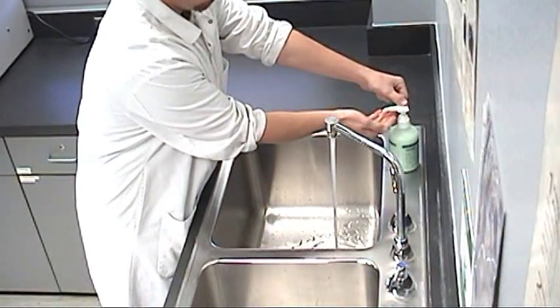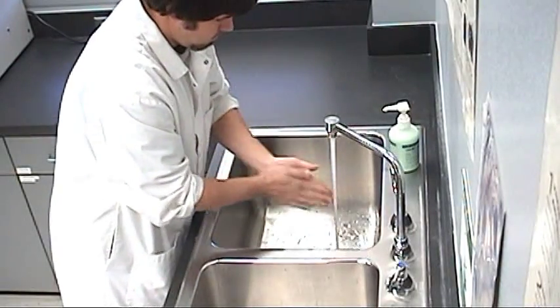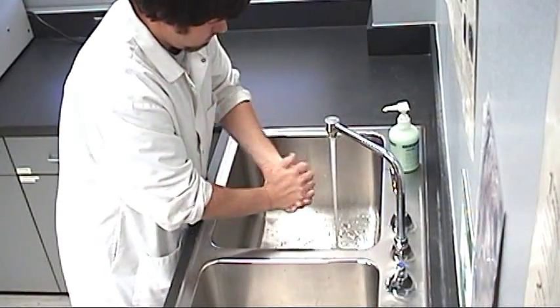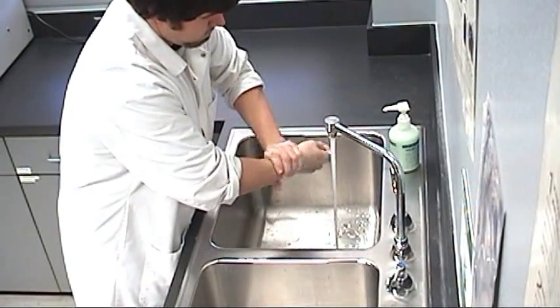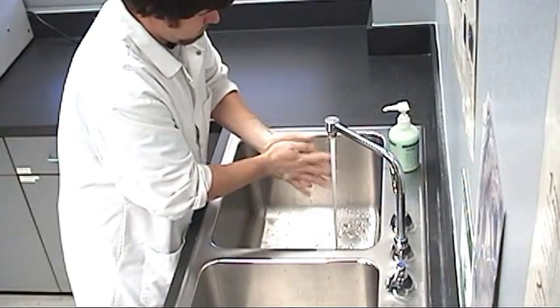Using antibacterial soap, wash your hands for a minimum of 15 seconds. Ensure you wash at least four inches above your wrists, scrubbing hard enough to remove dirt, microbes, and dead skin cells.